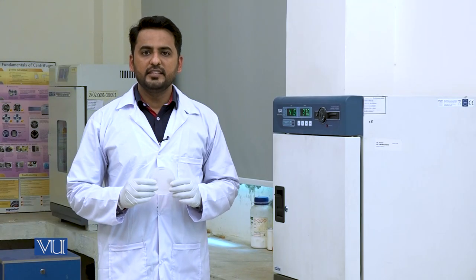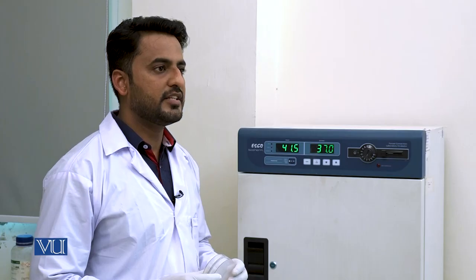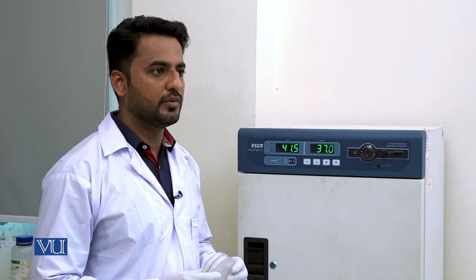Now we will incubate these plates at 37 degrees centigrade for 24 hours, and after 24 hours we will observe the growth.